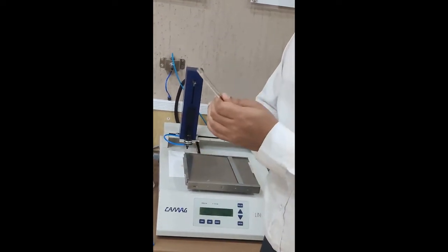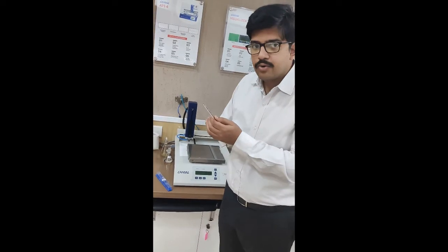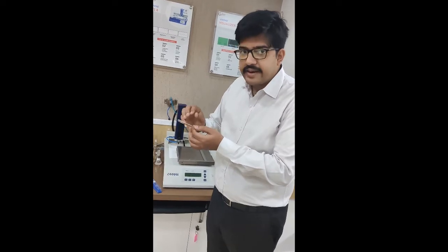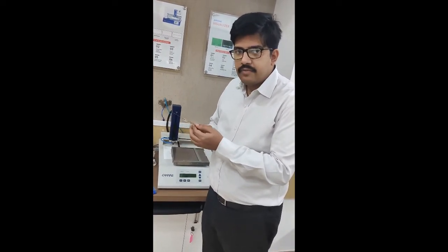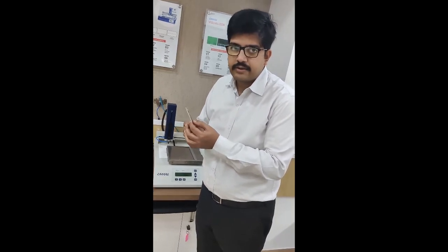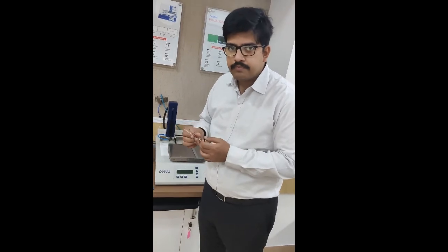If your syringe gets choked, we have a dedicated video explaining how to preliminary troubleshoot this problem by allowing solvent to get inside and using a sonicator to scrub out any material that has become blocked. If the problem persists, please contact us at lab@ancromdot.in or service@ancromdot.in and we will be happy to help you. Thank you.